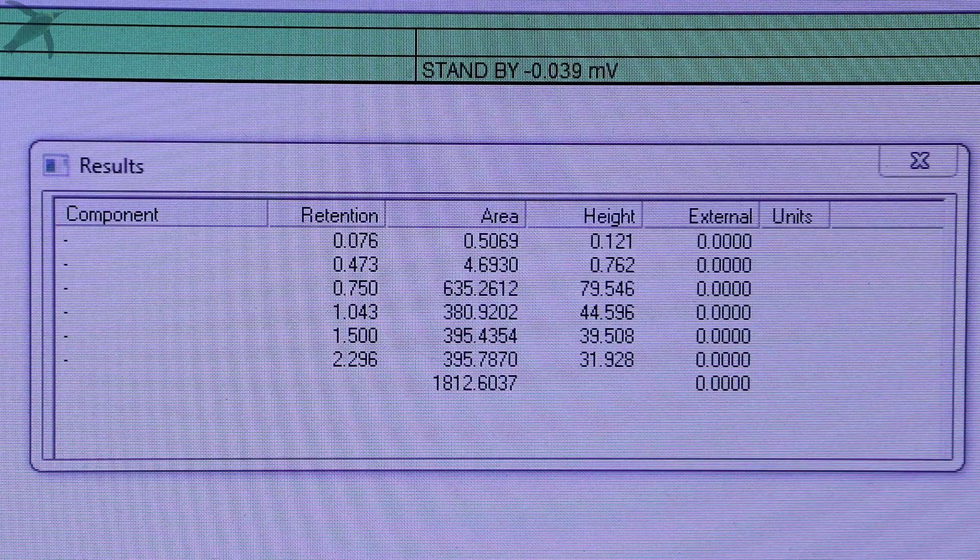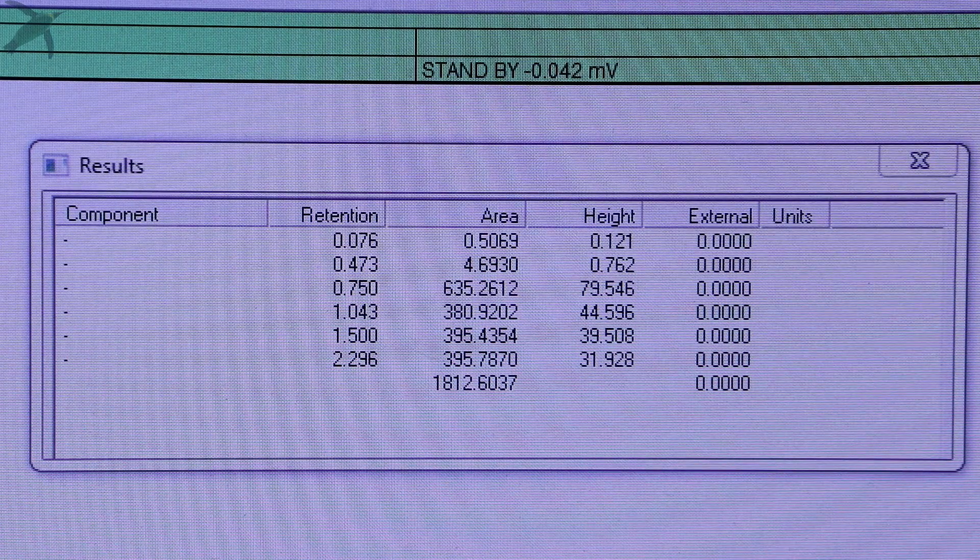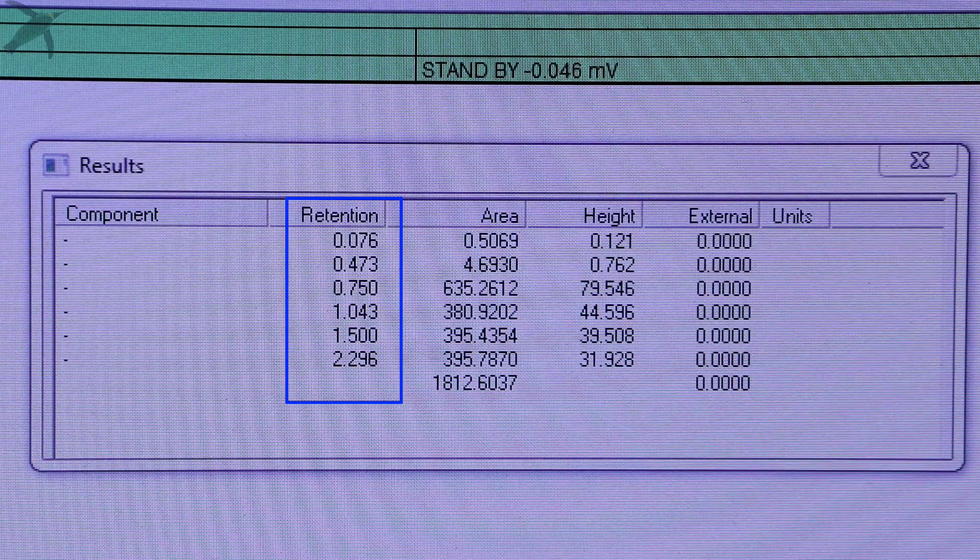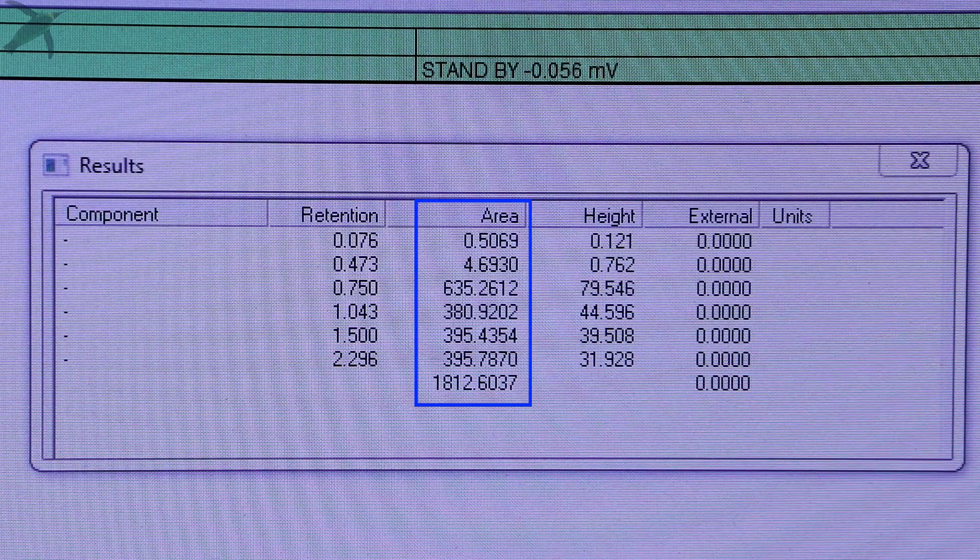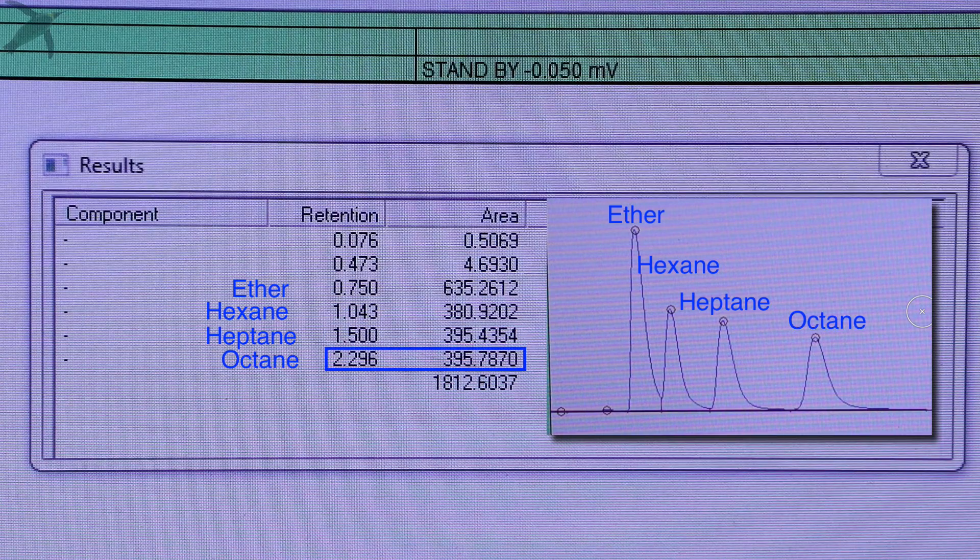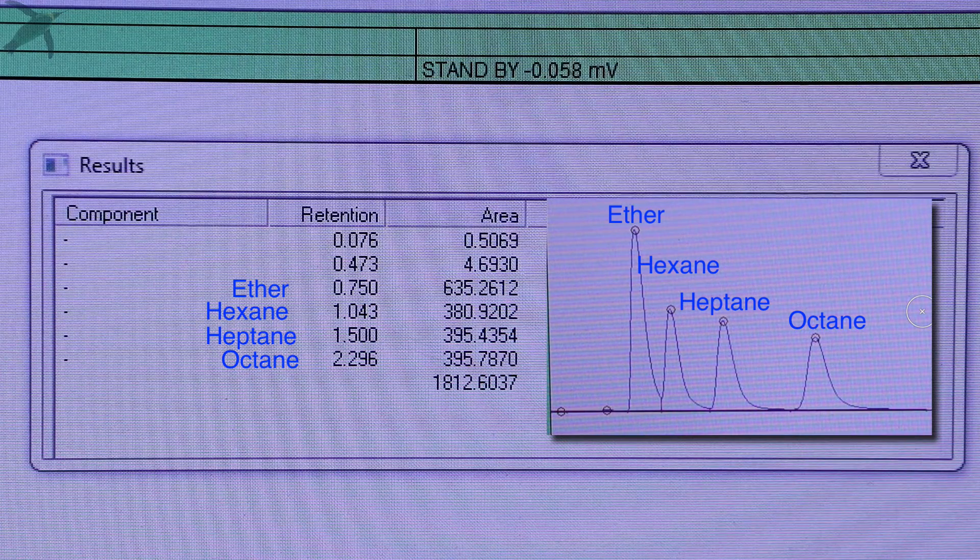If you look at your results window, there's a table that summarizes your analysis. You see that you have the two pieces of information that you most need: retention time and area. You will see four values, one for each peak. The first one is ether, then the second hexane, heptane, octane, and then you see the total area. Normally you want to ignore the ether peak because it's just the solvent we used to rinse the syringe.